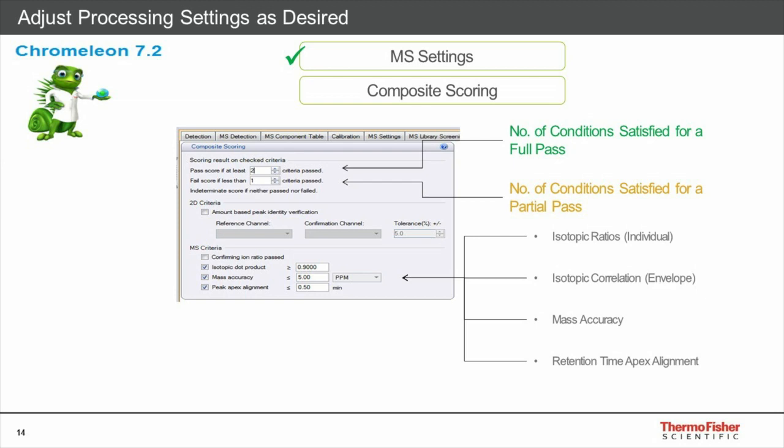What does that mean? It's a very fancy way of saying, if you have a peptide with a fixed chemical composition, it should have a fixed isotopic profile. How well does the isotopic profile match what you're actually seeing? The last is the mass accuracy. The mass accuracy is not just of the deconvoluted or the monoisotopic mass, that's of all of the isotopes. Remember, we're at high resolution. So the mono, the M+1, the M+2, even the M+3, they all have to be within 5 ppm. It needs to find all of them as well. So you're not just integrating a spurious result where you happen to have something that matched the mono. It actually has to have the isotopic pattern, and they all need to be pretty good.